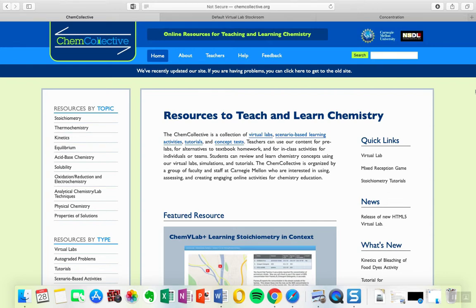This video is going to overview how to use ChemCollective, a virtual lab online tool. Virtual laboratories can be used in a variety of subjects to help students perform and analyze experiments without needing expensive equipment and lab space. ChemCollective is a collection of virtual labs, scenario-based learning activities, tutorials, and concept tests. It's a free online tool developed by the Carnegie Mellon faculty.